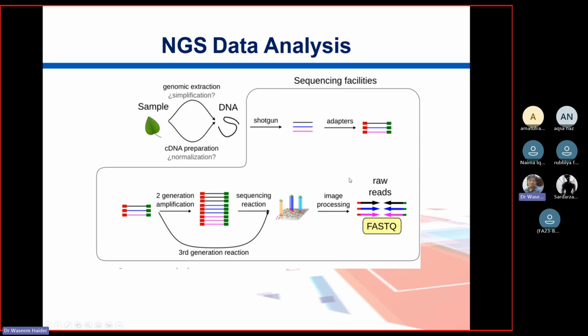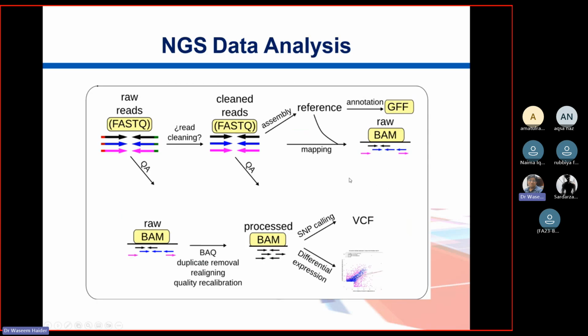So what is a format? Format is a way of presenting something or writing something. So you take the raw reads, and they are still in FASTQ format, and you clean them, where you remove those adapters, and then we go for some QC or QA steps. So up till this level, these reads are no more raw reads, but these are clean reads.